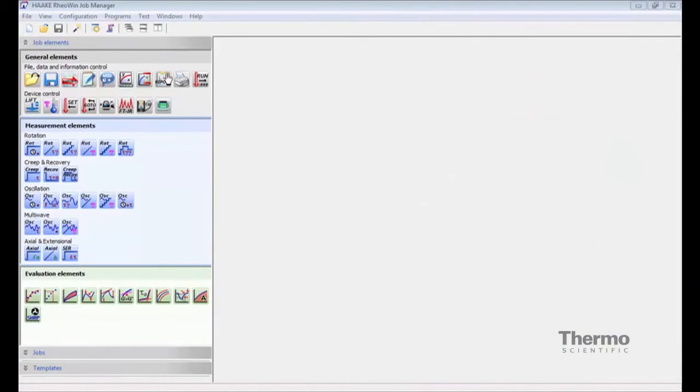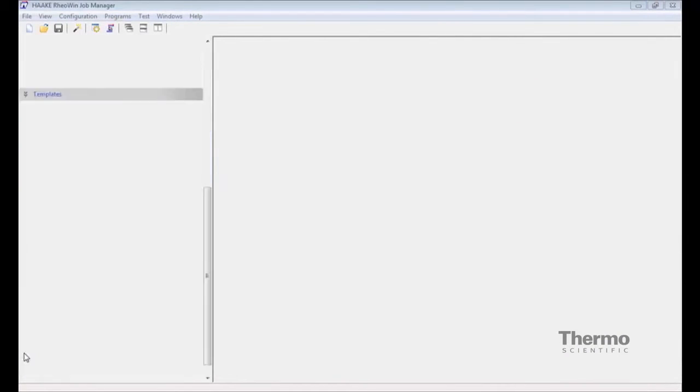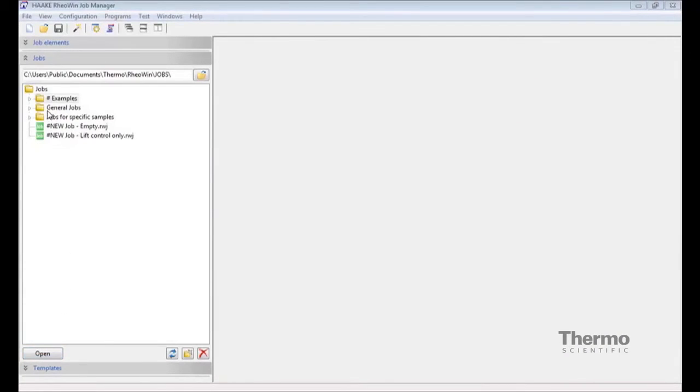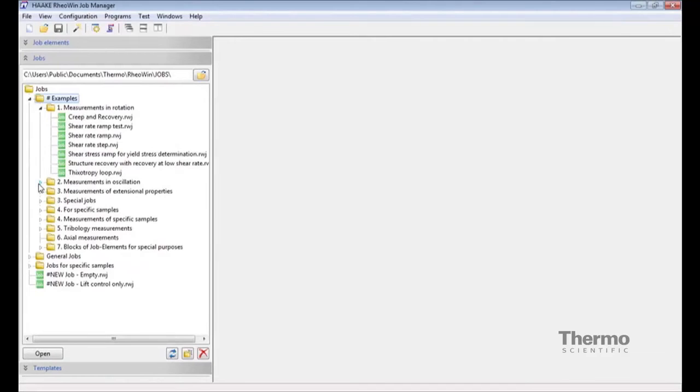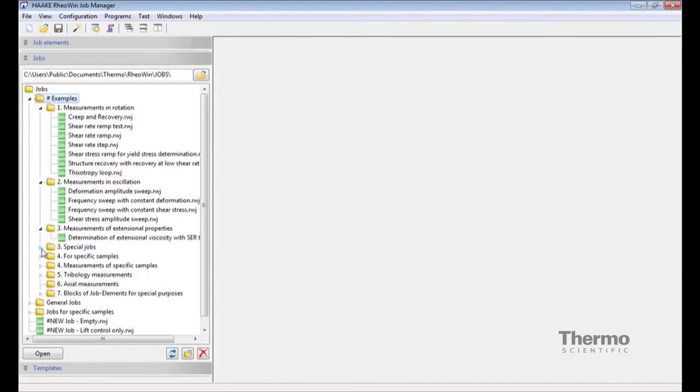The Thermoscientific Haake RheoWin software also offers a range of new intuitive features, such as a wide range of freely selectable measuring procedures, ranging from tests in rotation oscillation to more application specific measurements.